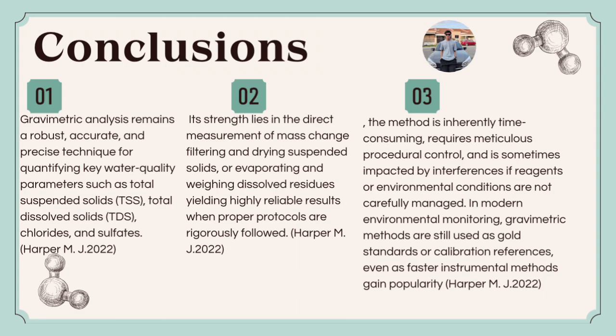However, it's important to acknowledge that gravimetric analysis is also time consuming and requires very careful control of the process. If the reagents or environmental conditions are not well managed, the accuracy can be affected. Despite the rise of faster modern instruments, gravimetric methods are still respected in the scientific and environmental community.